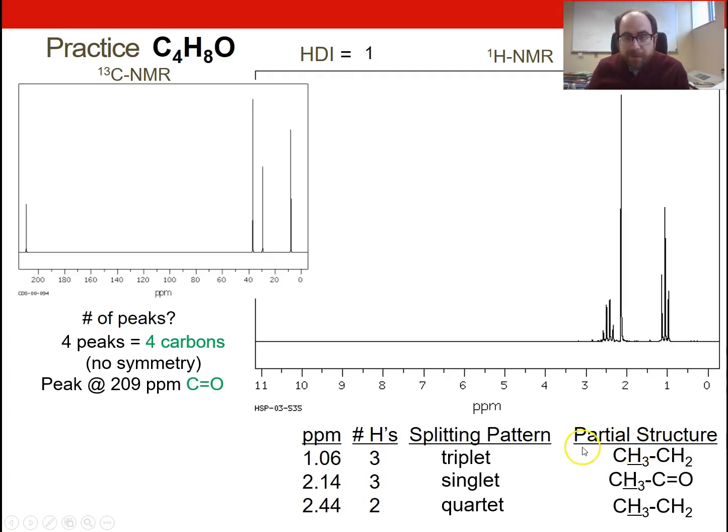And then with that in mind, we basically have all of the carbon atoms that we need. So ultimately, we need to take a look at the corresponding quartet. I have this listed as the CH3, but it is actually the CH2 that corresponds to this particular compound, with an integration of 2. It's going to be the one that is closer to the carbonyl, based on the chemical shift.